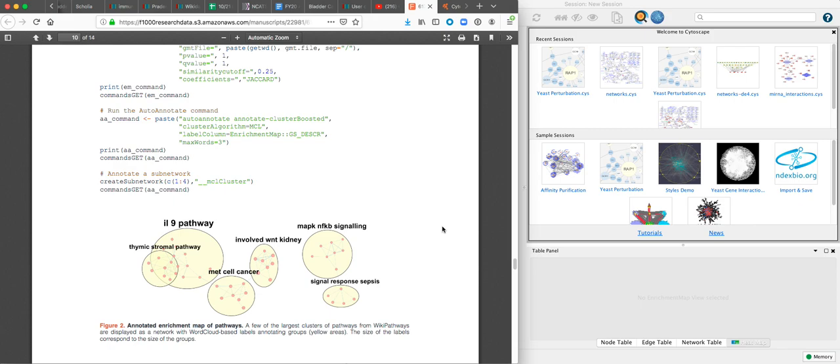Annotating them with word cloud results based on the titles or descriptions of those enriched terms to give you a higher level view of the biology that was affected by your results.